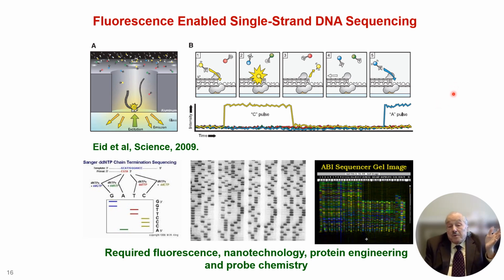They're all similar structures, but getting their sequences is difficult. But this has now been made possible, for under $1,000 you can get your whole genome done. And it could have never been accomplished without fluorescence, because none of the other methods that were tried besides fluorescence were capable of doing this.